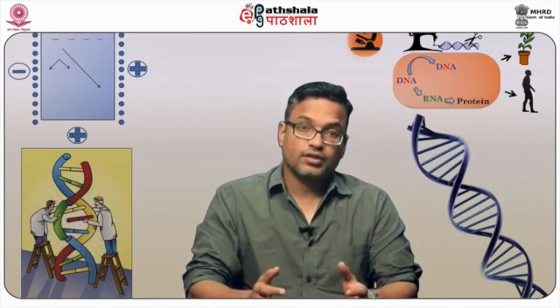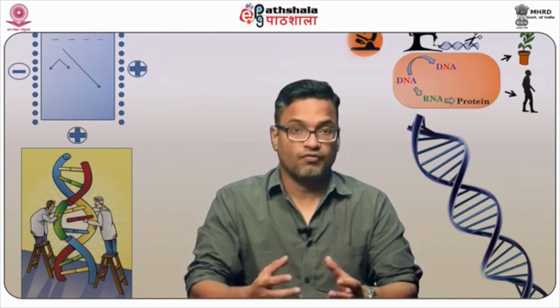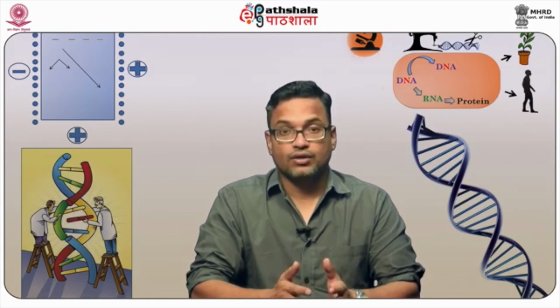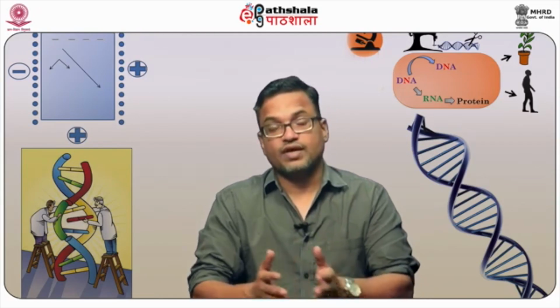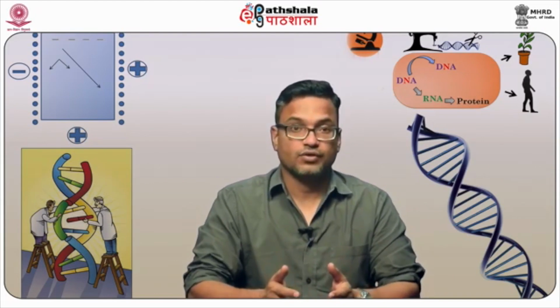The magnification and the resolution of a microscope remain the hallmark of microscopy imaging, because these two things should be good in terms of addressing any questions, and they both depend upon the numerical aperture of the objective lens. So that is very important for microscopy.